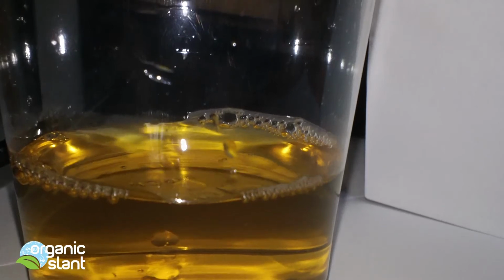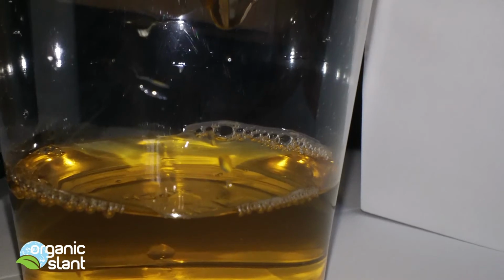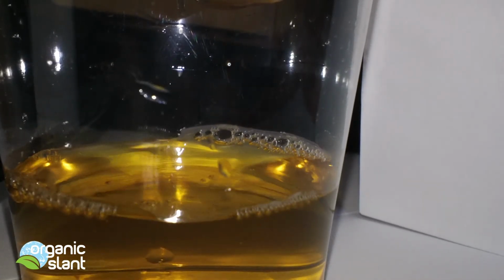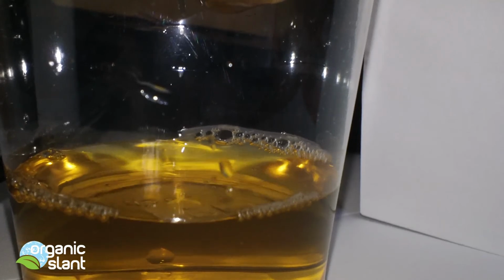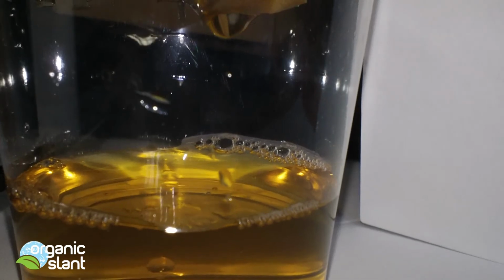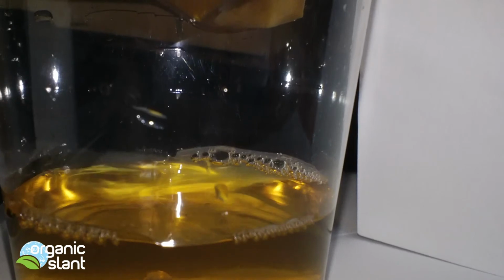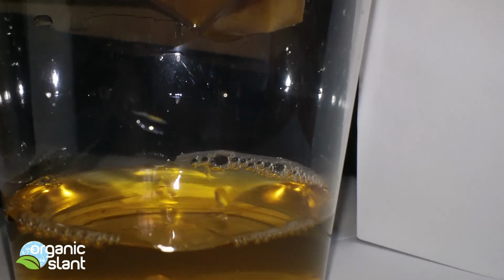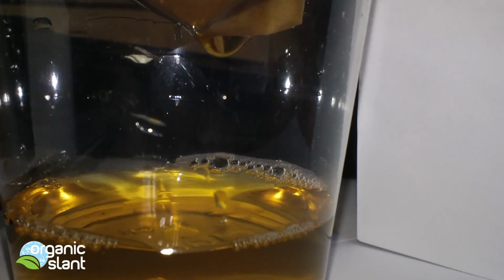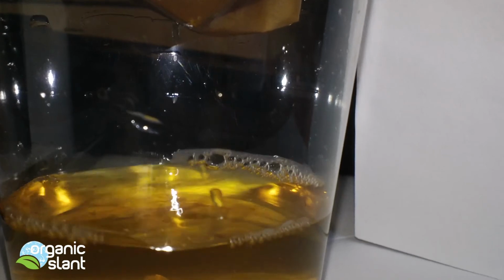My conclusion on the Tea's Tea Japanese green tea drink is I really can't see that it took a whole bunch of leaves to make the tea. So we're talking about a very little amount of tea leaves, for it to go 1.3 times over background. Another thing is I picked this one because it was the only one that was a product of Japan that I found in the store. I will be testing other American-made drinks, which are probably still from the tea leaves of the Asian region.